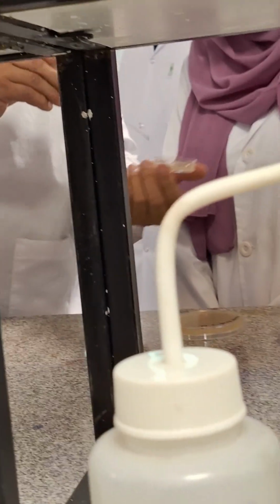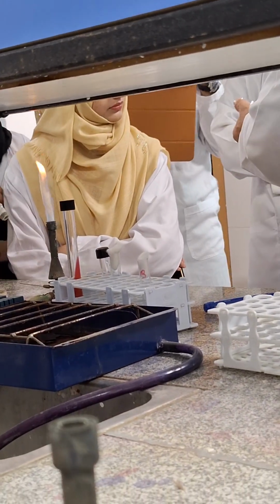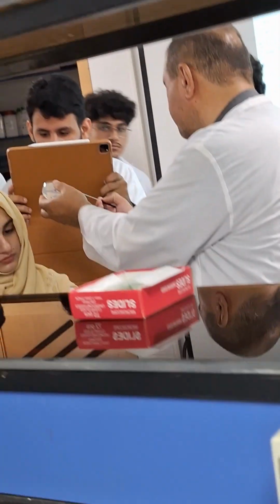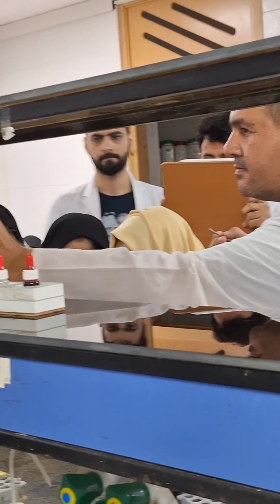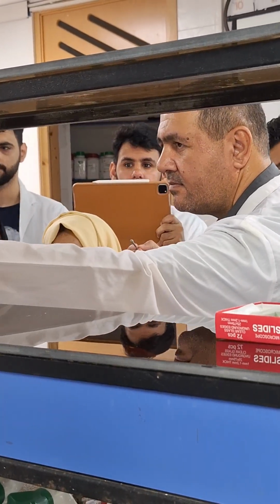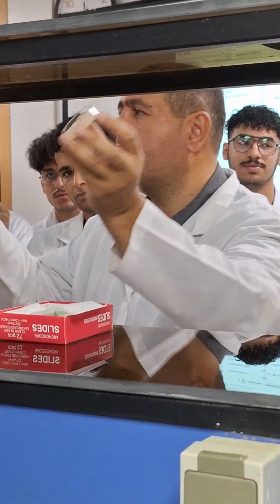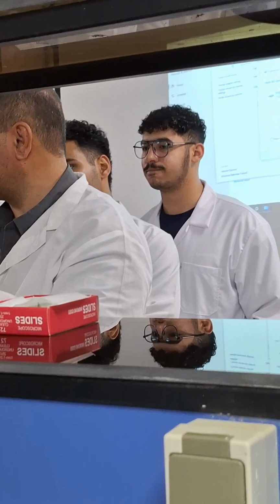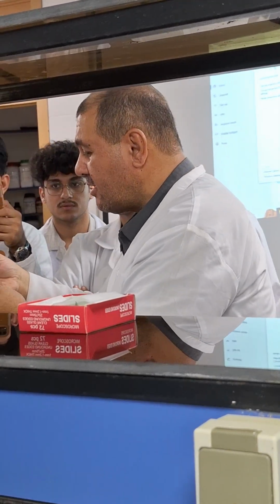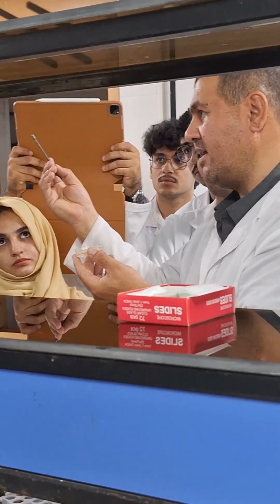This is bacteria. Then touch your loop on the surface of the agar. Don't push it, touch it, and pick up bacterial colonies. A loopful is enough.